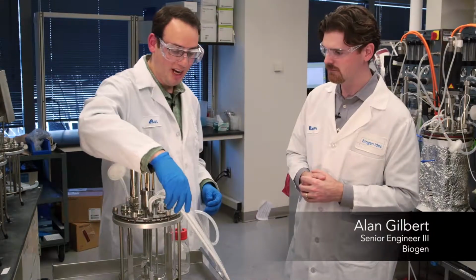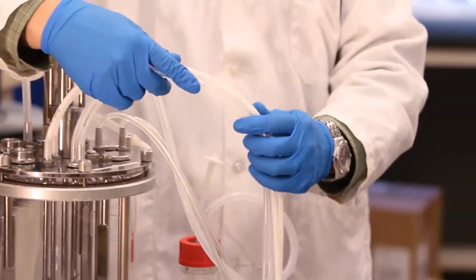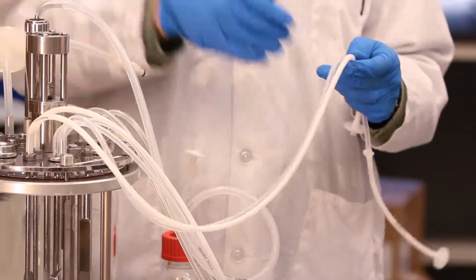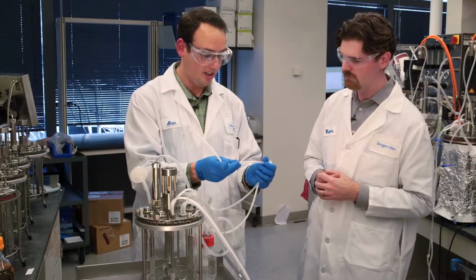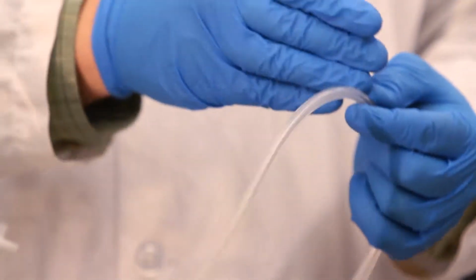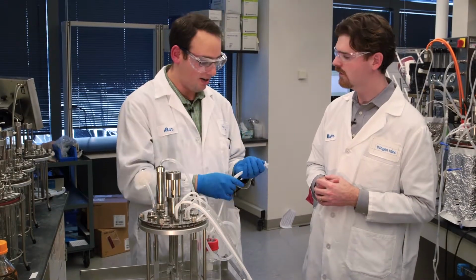So we have three different types of tubing. That all comes down to how we get things from outside the bioreactor sterilely inside of our bioreactor. One is clear, and that's like what we saw over at the pumps before. That's very easy to pump on. But what it's not is an easy way to connect to things that are from outside the bioreactor.